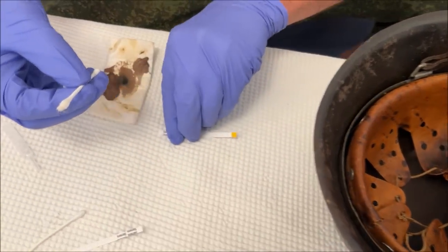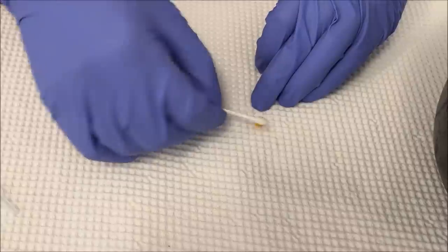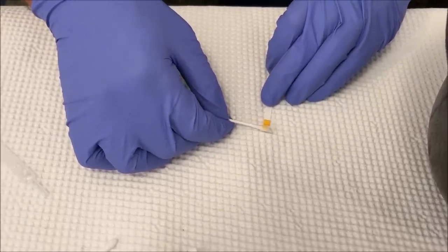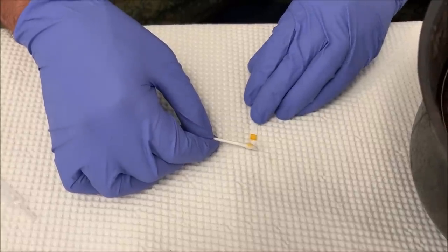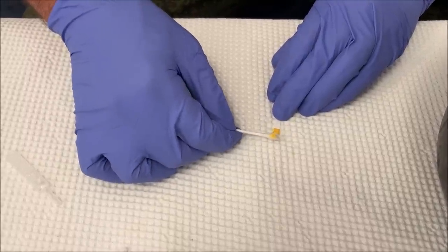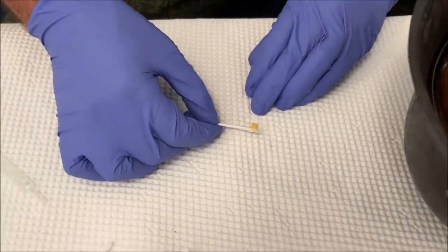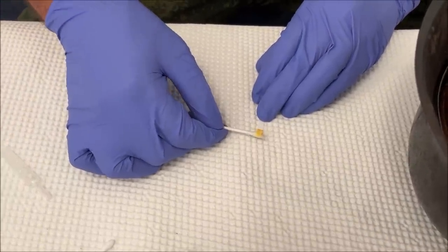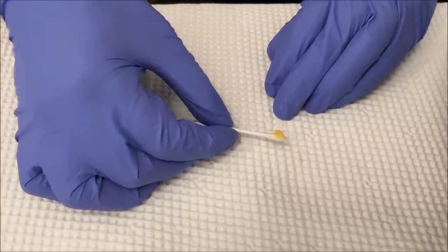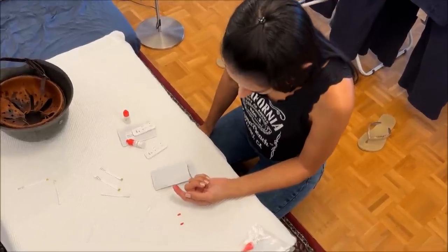Nothing visible to the naked eye. Both the q-tip and the test seem to remain very yellow. I don't consider this a hundred percent conclusive that there's no blood inside the helmet, for the reasons stated — I didn't want to rub too hard and risk damaging it. So the tests remain pretty much inconclusive.